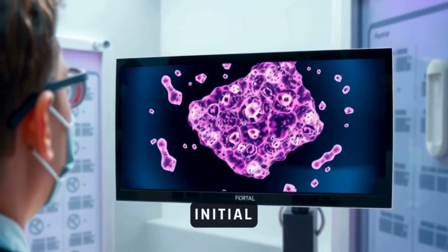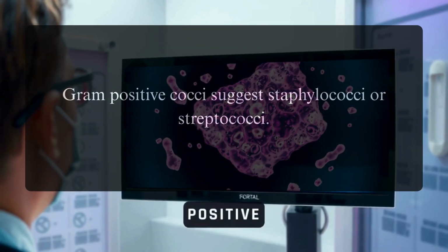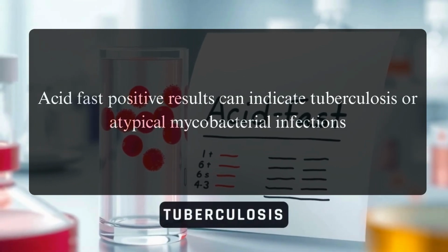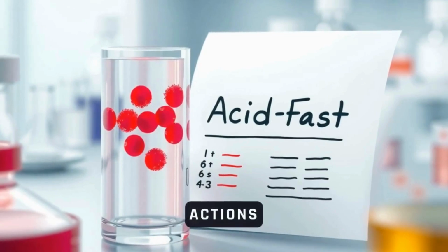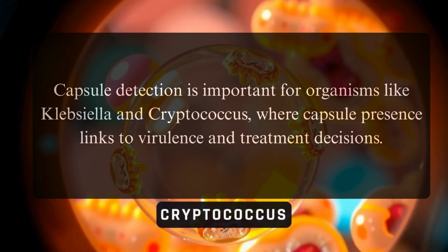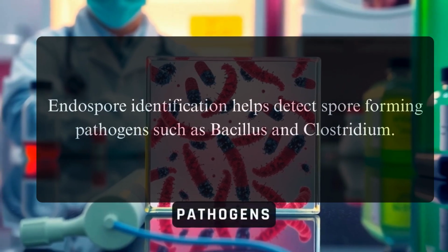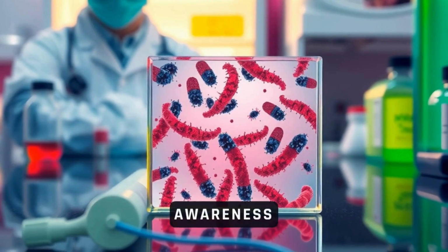Gram results guide initial antibiotic choices and infection control. For example, gram-positive cocci suggests staphylococci or streptococci. Acid-fast positive results can indicate tuberculosis or atypical mycobacterial infections and trigger specific public health and treatment actions. Capsule detection is important for organisms like Klebsiella and Cryptococcus, where capsule presence links to virulence and treatment decisions. Endospore identification helps detect spore-forming pathogens such as Bacillus and Clostridium, which require special handling and clinical awareness.